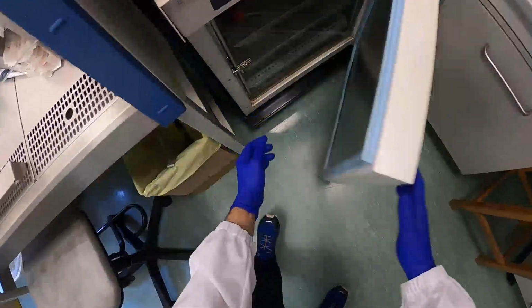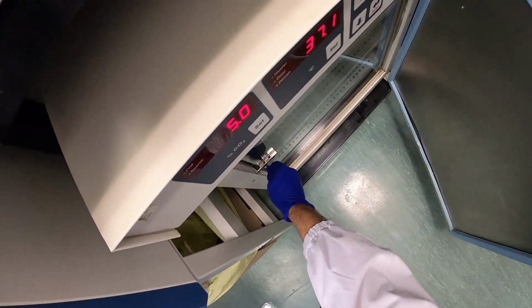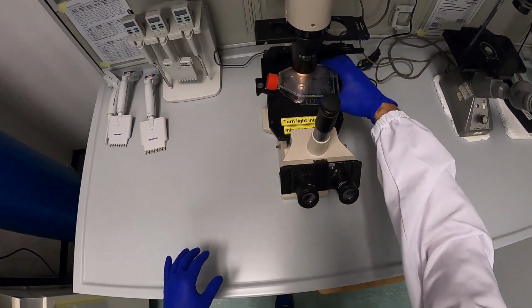5 minutes later. So, okay, let's have a look at the flask. It has been there at 37 for 5 minutes. And let's place it under the microscope and let's have a look.